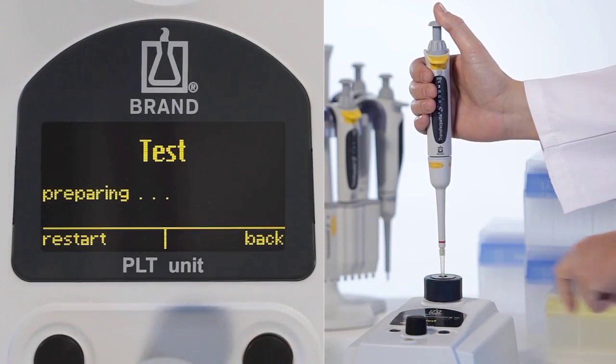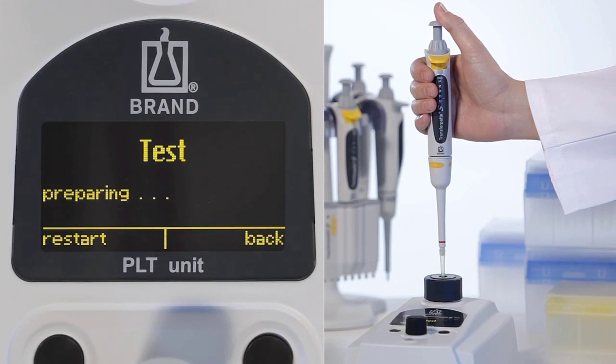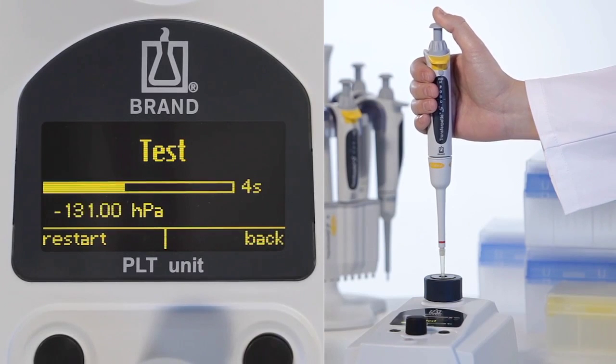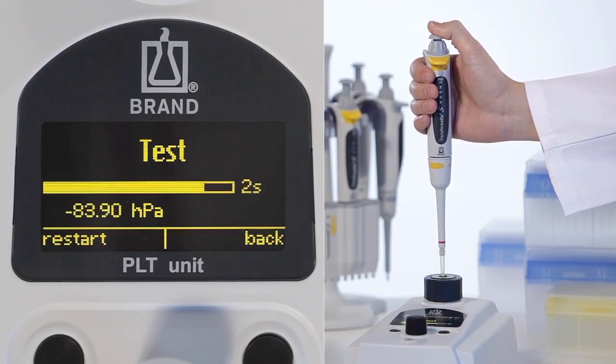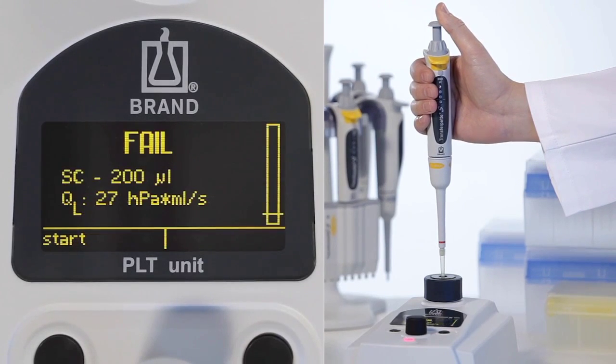We test a second pipette with a tip attached and again press down the pipetting button several times during the measuring phase. This pipetting system leaks.